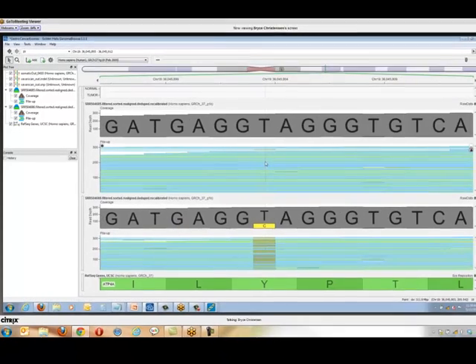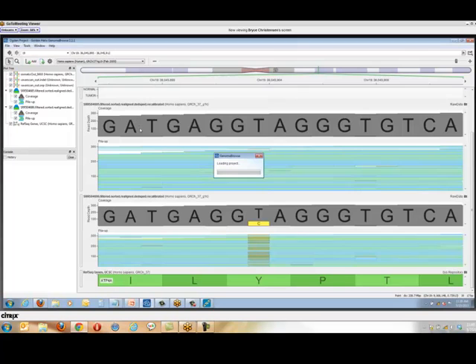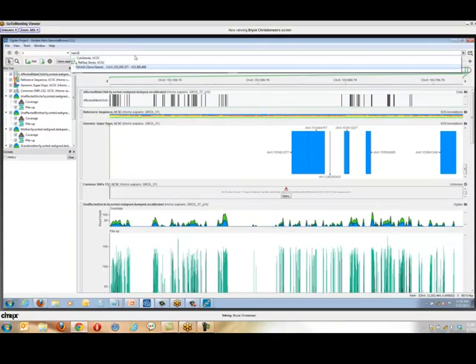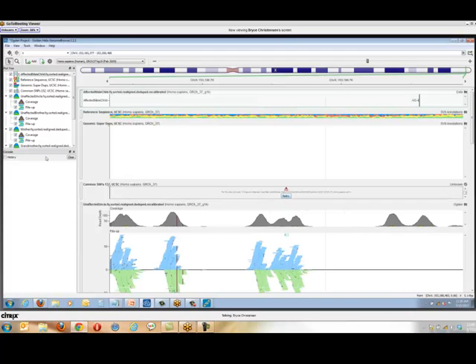I will show you. Let's find the right project. So this is GenomeBrowse that we've already mentioned earlier. I can find the same set of samples, and let's search that gene, NAA10. Whoops, it can't find one of my tracks.